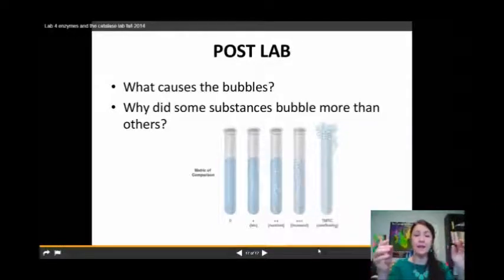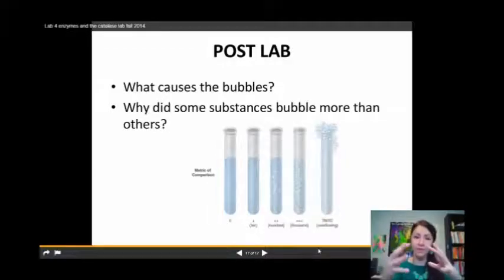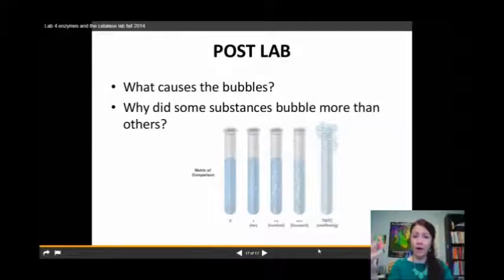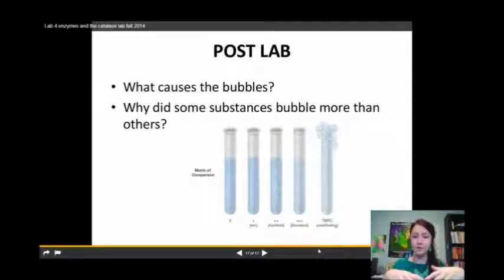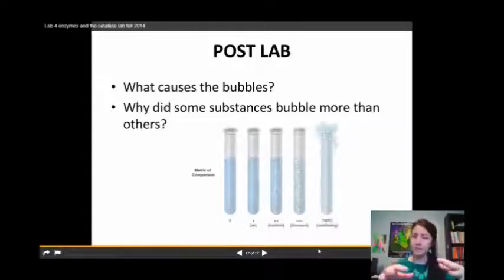We're going to be using a scientific metric of comparison. One thing that's important for scientists is to quantify the amount of things that we are measuring in the experiment, so that if scientists in the future want to do this experiment themselves, they can say, I also got thousands of bubbles, or I also got too many to count. It's important to have that metric of comparison. Otherwise, what one scientist says is a lot of bubbles may be completely different from what another scientist says is a lot of bubbles. So we try to make things as accurate as possible so that we know we're talking the same language and doing the same experiment.